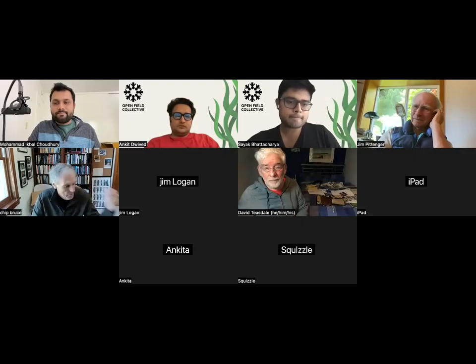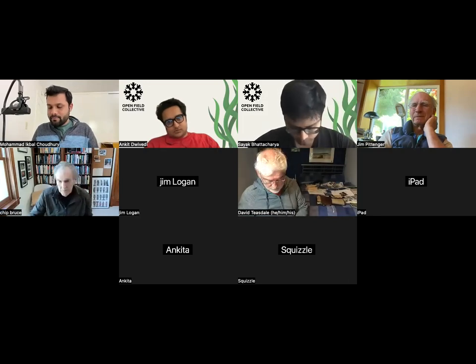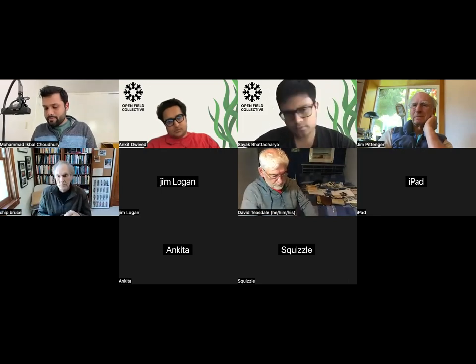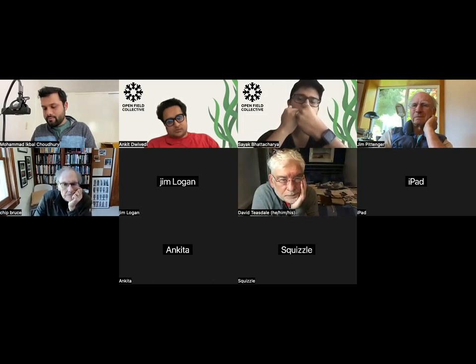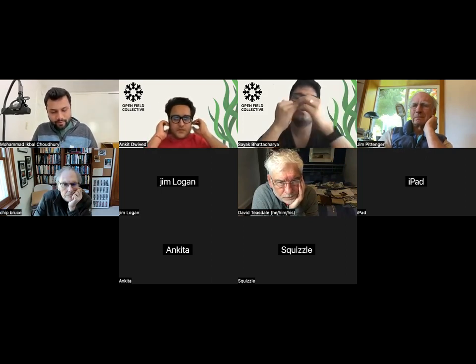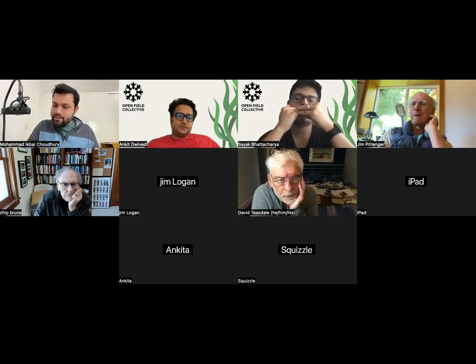I quickly wanted to add to the light source. Iqbal, you remember sometimes the light source, even in the dim one, was very intense and focused on one point. So you can stick a tape over it to diffuse light a bit if you feel like the light is too intense and is just at the center of your camera or something. It gives you a good picture, actually.